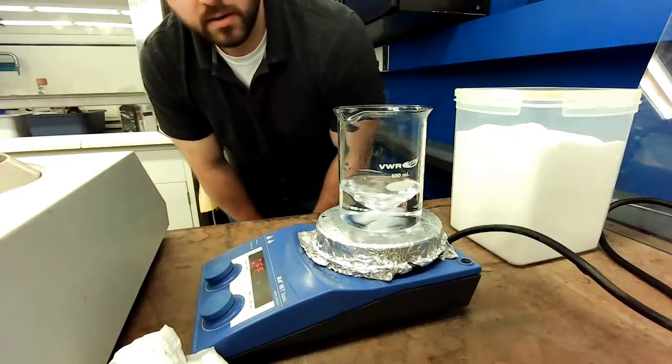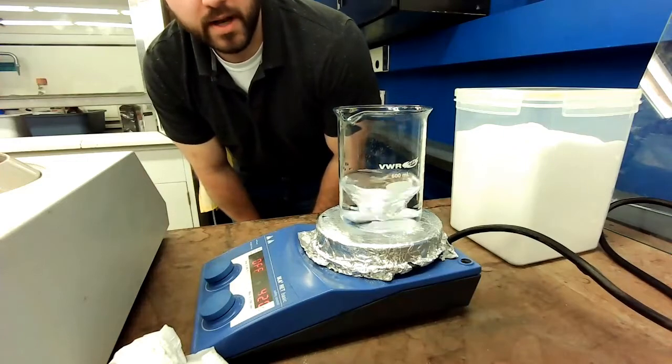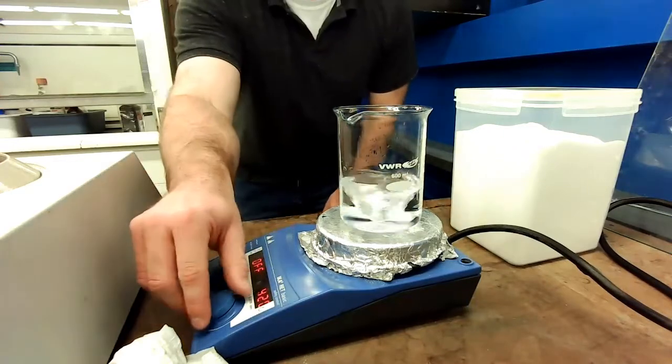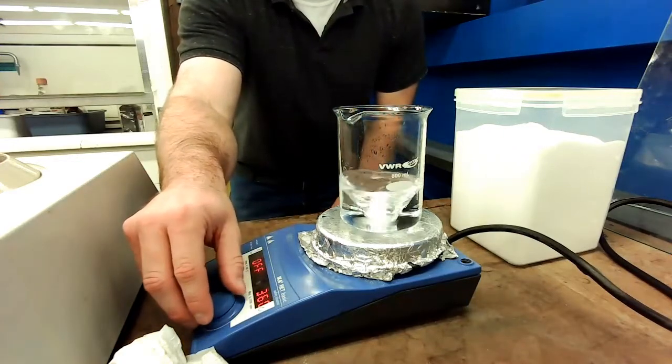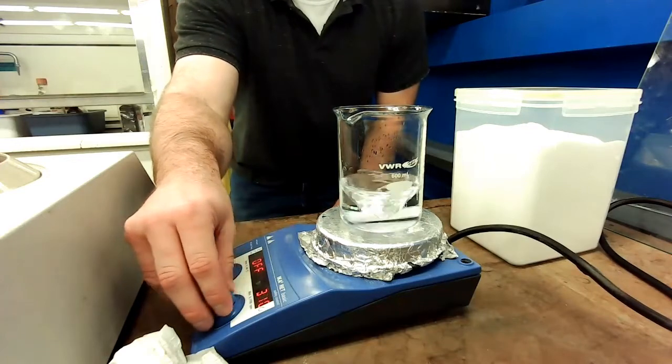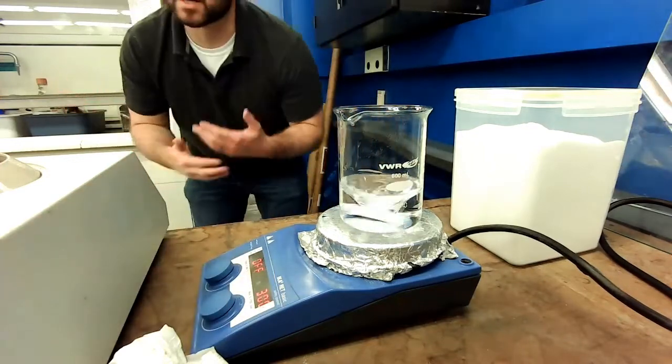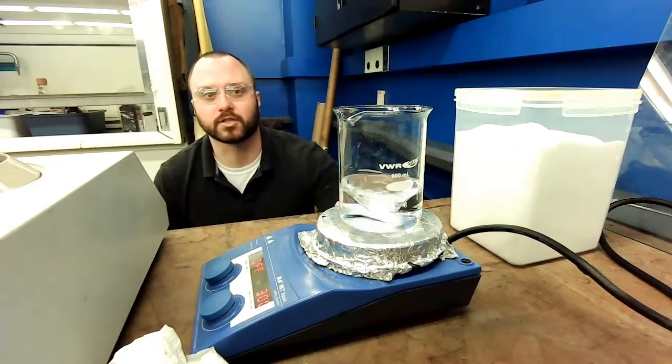So right now it's at 720 revolutions per minute. That might be a bit aggressive. I'm going to turn it down to about 300, okay? And I can play with this. It shouldn't really affect our results all that much, okay?